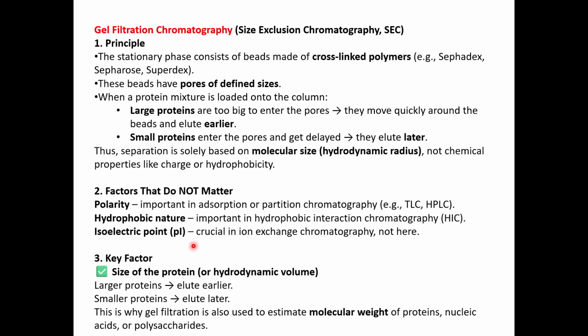The isoelectric point, pI, is not crucial here. pI plays a role in ion exchange chromatography, both cation and anion exchange, because depending on your pH and the pI of your protein, it will attain a positive or a negative charge, based on which you can separate in ion exchange and not in gel filtration.